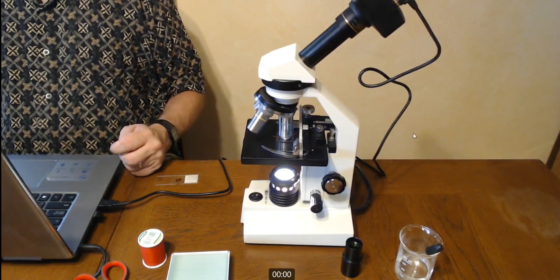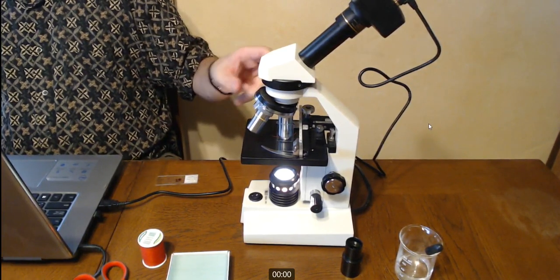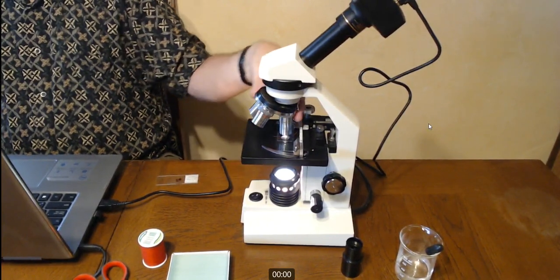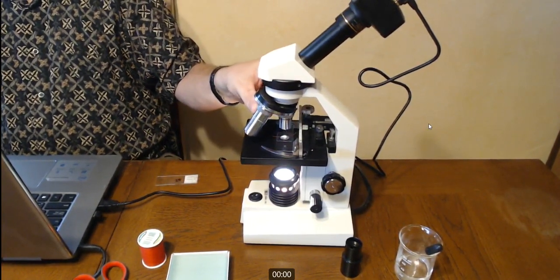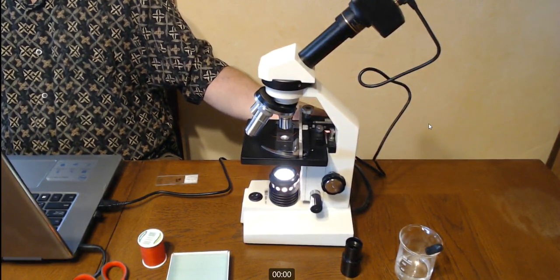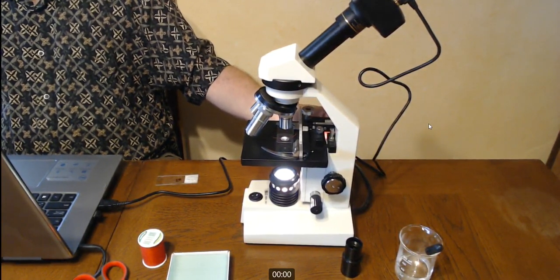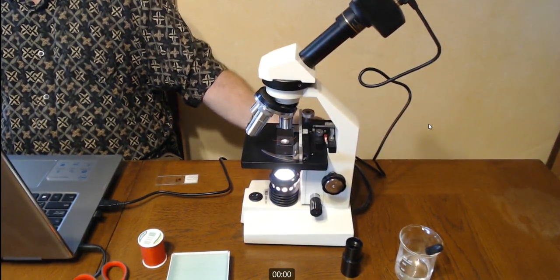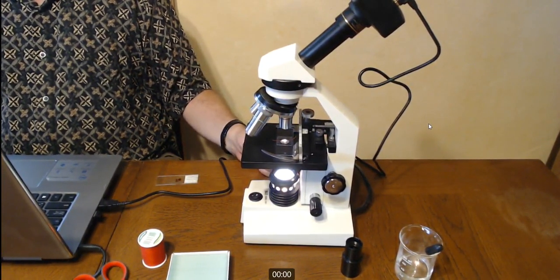Okay, so when you remove a slide, first thing you want to do is put the low power objective down. That's because the next thing you want to do is put the stage all the way down. If you have a high power and you do the stage down first, if you pick the wrong direction, you can slam it into the stage. Or you slam the stage into the objective. So I brought the stage all the way down now.